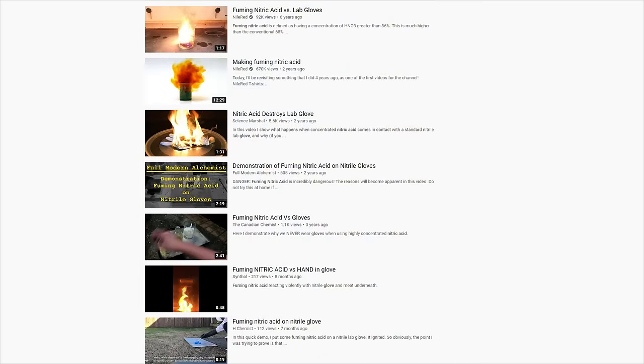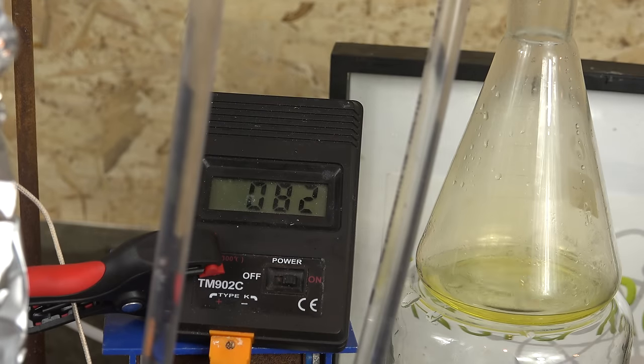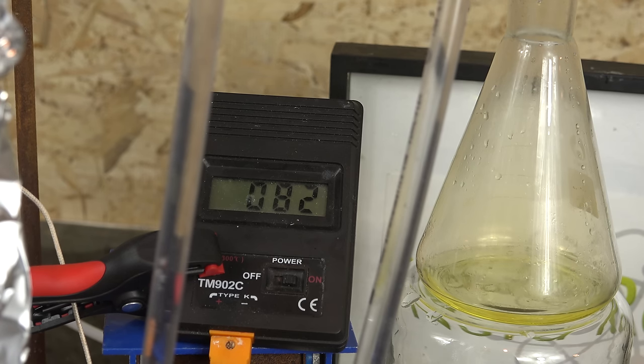So what are all of those videos showing? They are showing the reaction of nitrile gloves with fuming nitric acid. Fuming nitric acid is acid with very low water content, often less than 2%. This is a very highly concentrated acid and needs special procedures to make. You actually cannot obtain this by straight fractional distillation of a lower concentration as you'll reach the azeotrope first. It's extremely reactive and quite dangerous, especially to nitrile gloves.